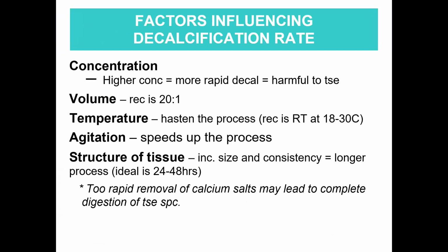So you have here several factors that may affect your decalcification rate. First is your concentration. A higher concentration, of course, would lead to a more rapid decalcification time. However, it is more harmful to your tissues. Volume recommended is 20:1. 20 ang volume sa inyong decalcification agent is to 1 sa your tissue.